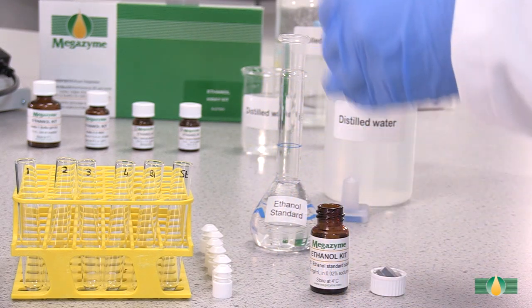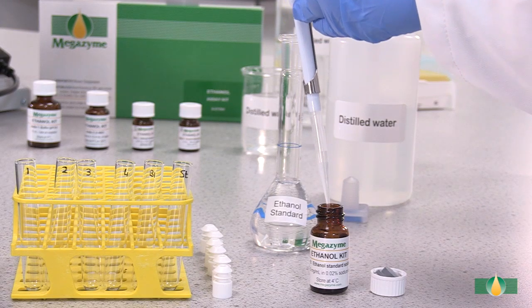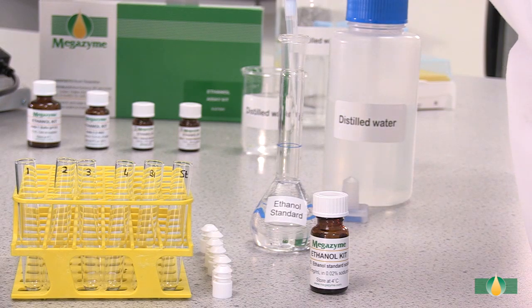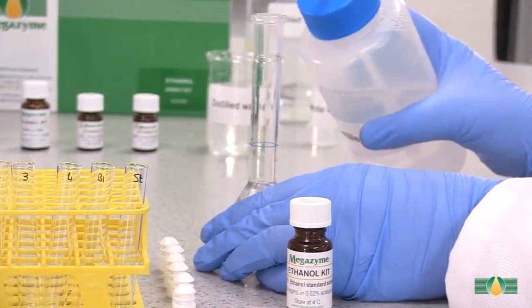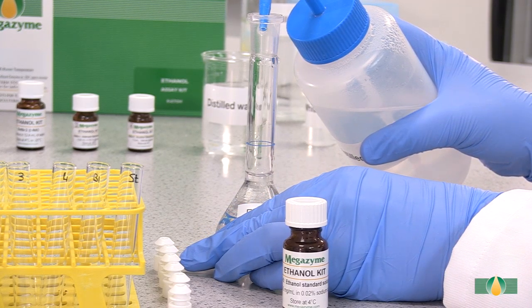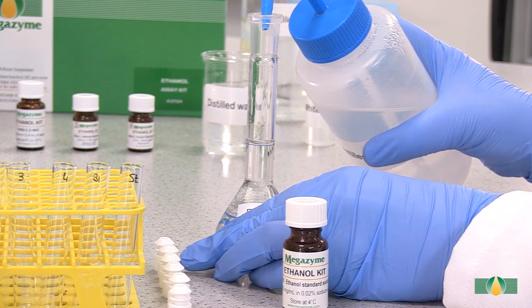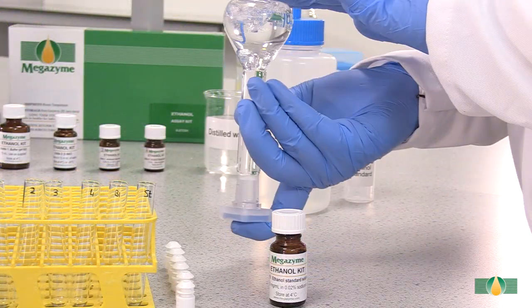To use bottle five, the kit standard, dilute 0.5 milliliters of its contents to 50 milliliters with distilled water and mix thoroughly.